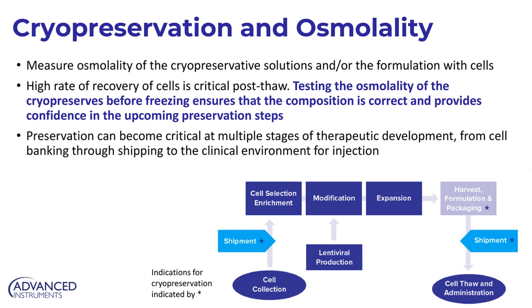So here I just mentioned testing the osmolality of the cryopreservatives before cryopreservation is key to make sure that you're not going to do any unintentional damage, obviously, to the therapy. But also, it's important to remember that upon thawing, this would be another great time to measure the osmolality of the formulations.